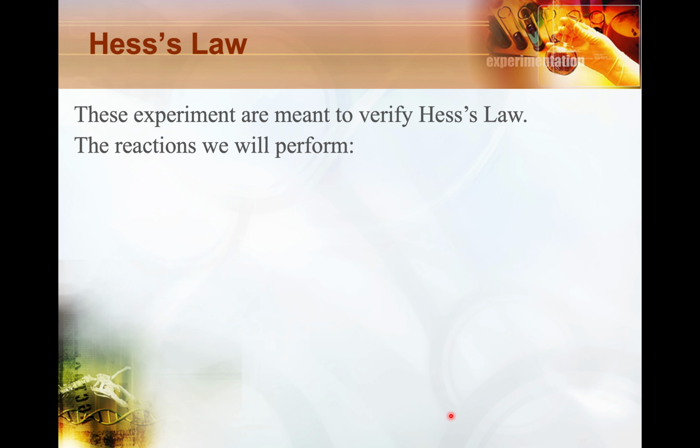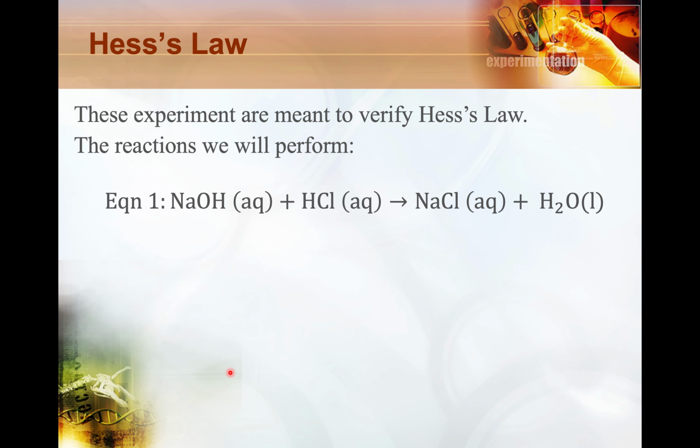So all of these experiments today, beyond just determining the enthalpy of each reaction, is meant to verify Hess's law. So in these reactions that you'll be doing in the experiment, you'll be mixing aqueous solution of sodium hydroxide with a solution of hydrochloric acid and performing the neutralization reaction to make the salts, sodium chloride, and water. You'll also see the heat of dissolution, which is the process in which, in this case, sodium hydroxide dissolves into water. And this will cause heat.